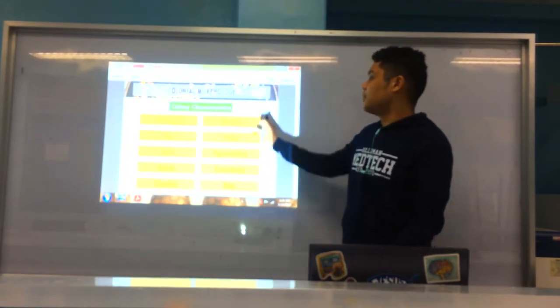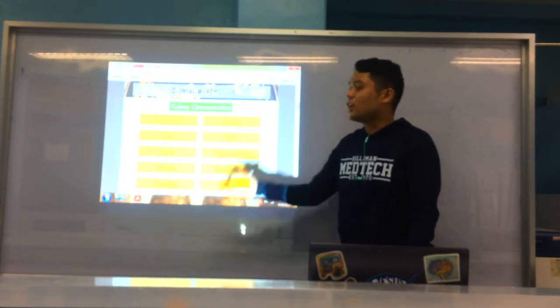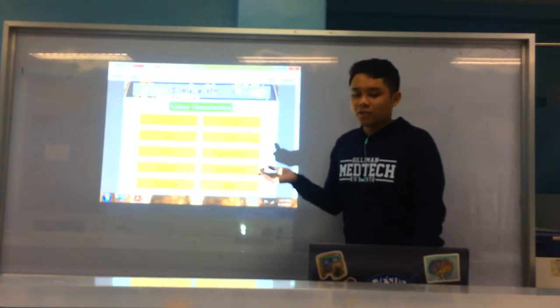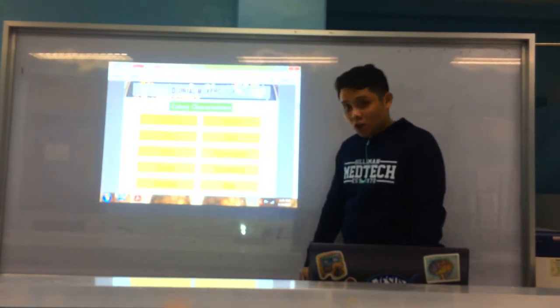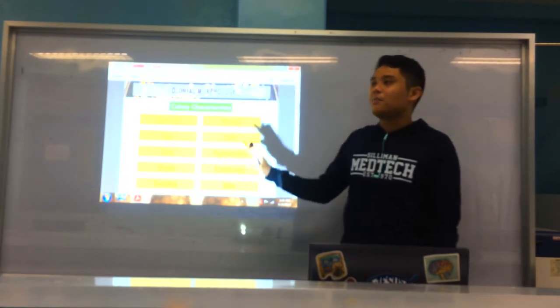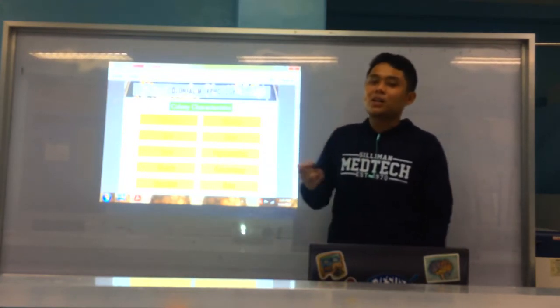Now, we will discuss the different colony characteristics. We'll start first with hemolysis, then size. What are the words to describe size? You also have form, margin, elevation, density, color, pigmentation, consistency, and odor. These are the different characteristics of the colonies of your bacteria that we can examine and note.